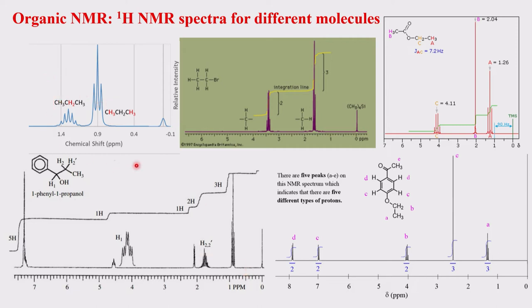Now look at this particular spectrum. It is converted from frequency into chemical shift, which is a very standard thing: you have a reference at some frequency and your nuclei at another frequency, and the difference is divided by the frequency of the field at which you are applying the magnetic field. That is 100 megahertz means divide by 100, 200 megahertz by 200. Then you get a specific value, referred to as the chemical shift. Therefore, NMR spectra are shown as a function of chemical shift on the x-axis with respect to some standard, which we call zero. You can have positive and negative, but right now let us look at the positive only for the organic. Very rarely will you find organic in the negative, but there are certain cases. We will not go into the details of that.